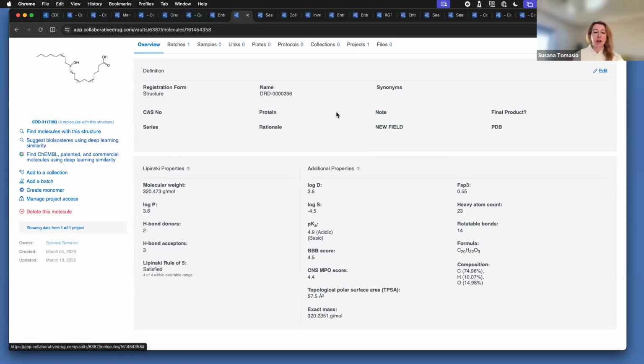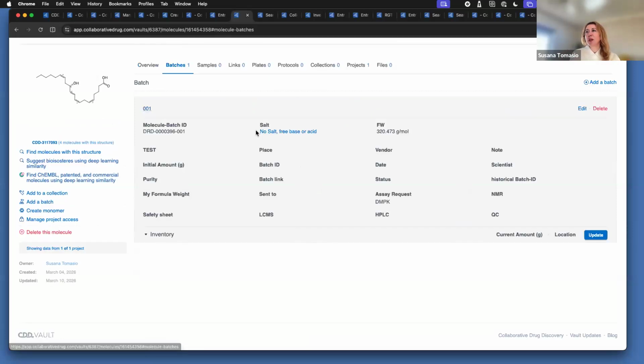So all of these fields are customizable, and the Vault administrator can create these fields based on what information or needs you have for the workflow. That's something we usually would discuss with you and help you set up, because they are all customizable. What we see here can be different in your Vault. I hope that answers the question, but feel free to ask any other questions.